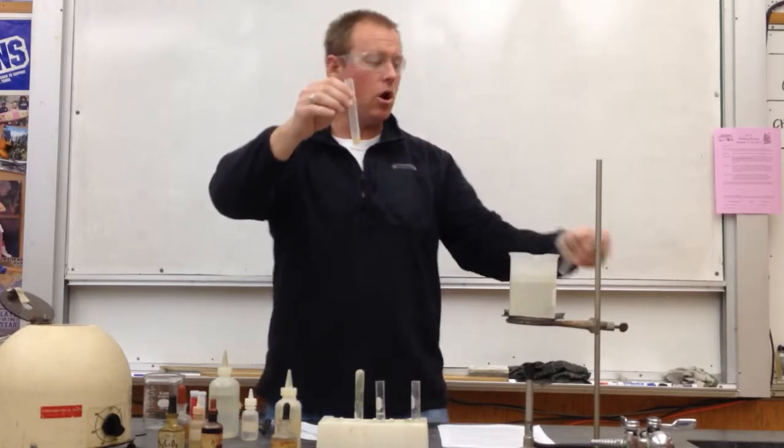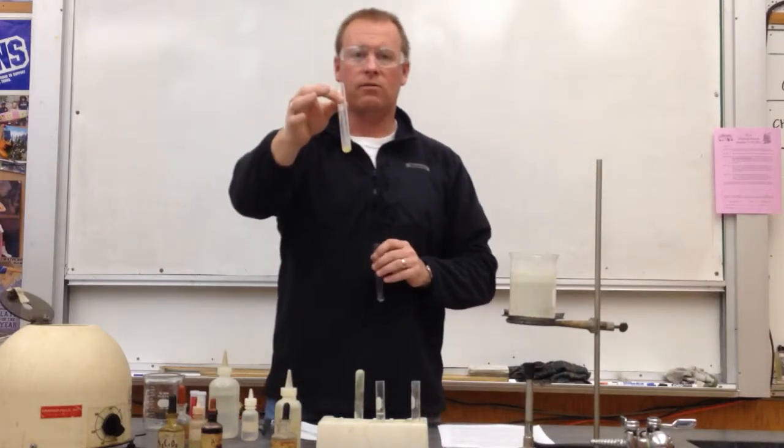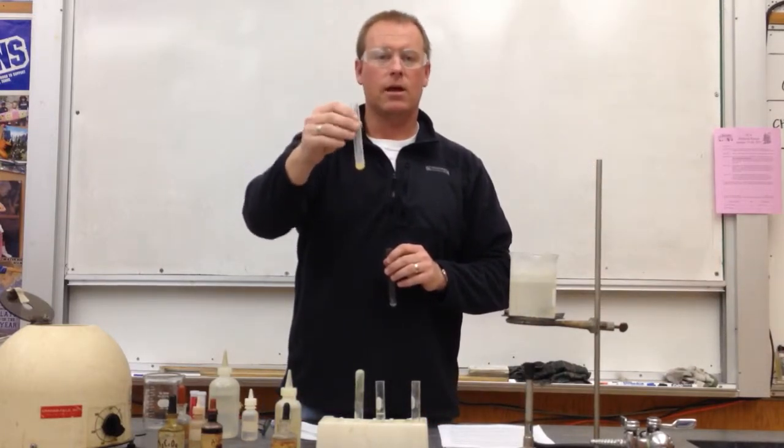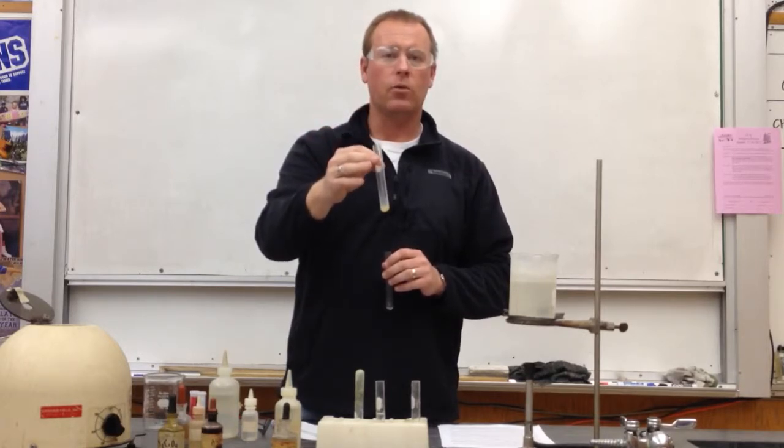So I can now discard that solution and save the precipitate for step 9. That's it for step 8. We know we might have aluminum. Let's go to step 9 and confirm that we do indeed have it.